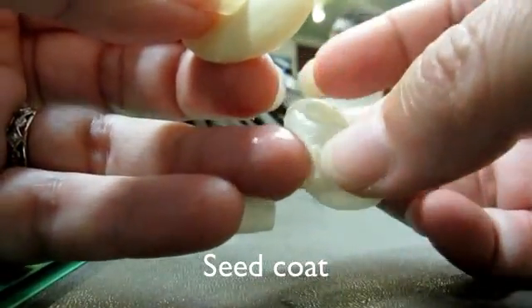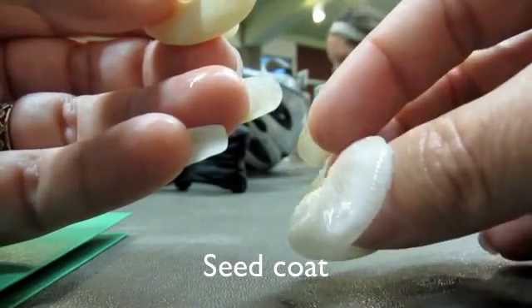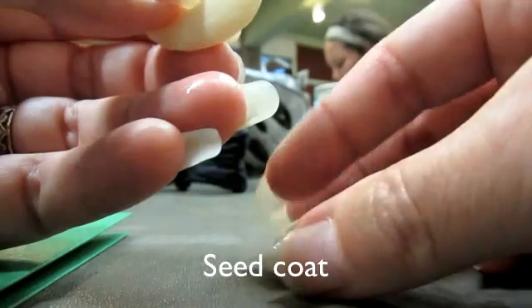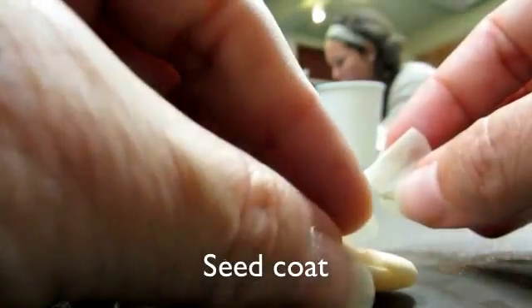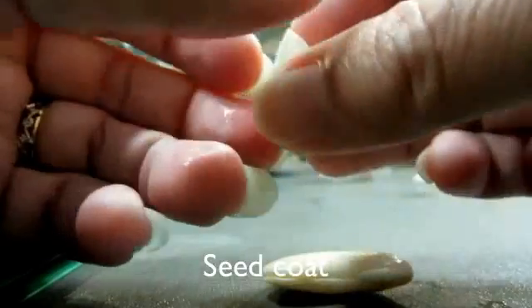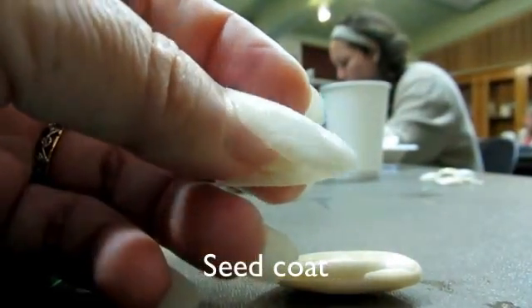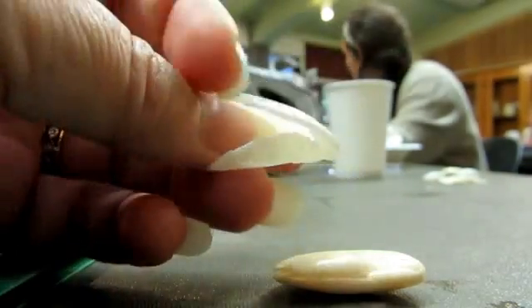And what's a coat for? It's protection. Exactly. Now the funny thing about the lima bean coat, and the coat of any seed in general, is that it's got to do this balancing act. It's got to protect the seed from drying out, but it's also got to allow the seed to get wet.